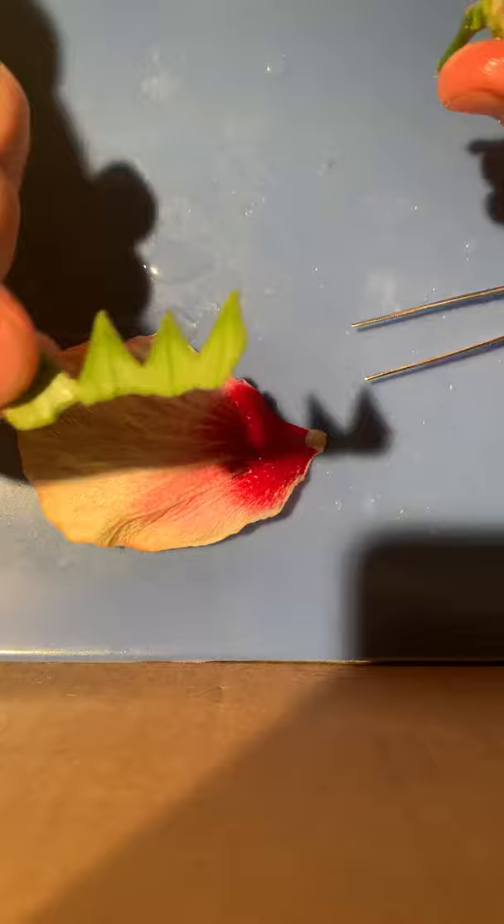Here's a closer look at one single petal, and then this is the sepal that I removed, which protects the flower bud.